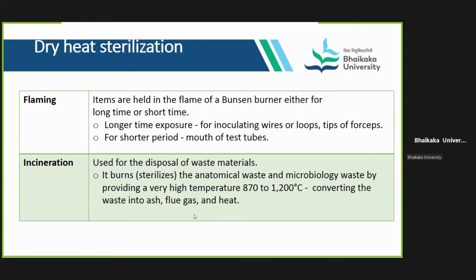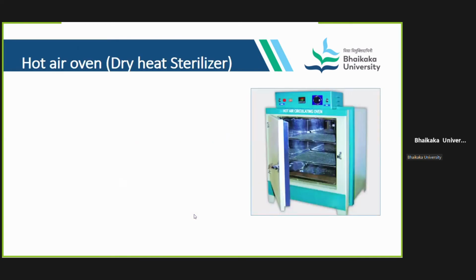Test tubes, you can just pass the mouths of these test tubes which are being used for inoculation through the flame and ensure that they are disinfected. You're not going to make them sterile, but you pass through the flame 2 or 3 times. You pass the slides through the flame 2 or 3 times just to ensure the microbial load is reduced. And I'm sure you know what incineration is. Have you seen the incinerator that we have in the hospital? Anyone?